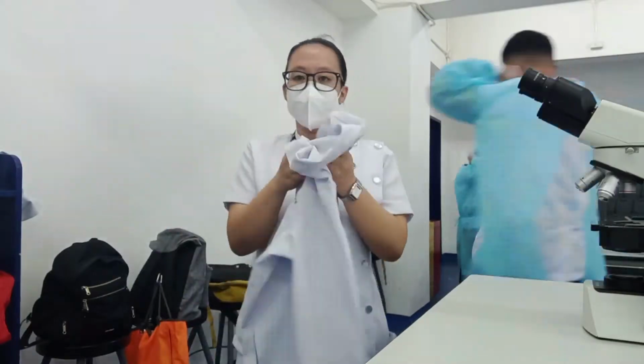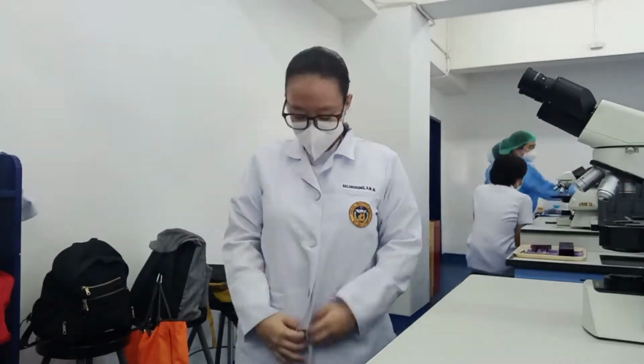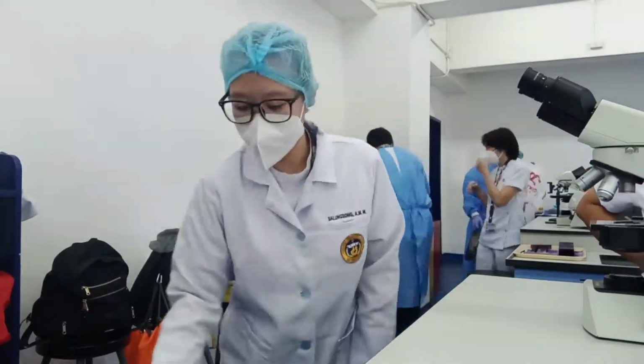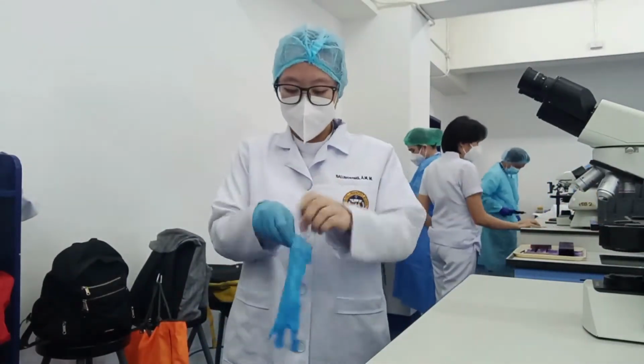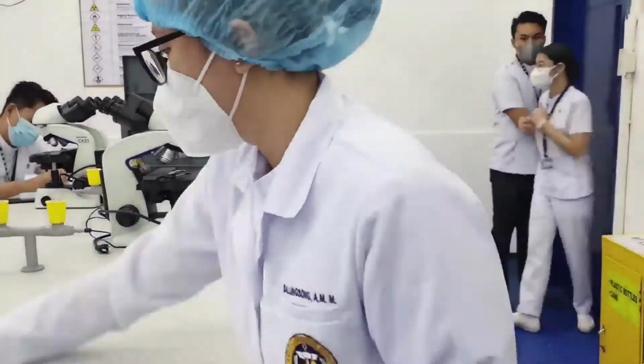Before performing the test, make sure to don the PPE. Wear your laboratory gown, mask, head cap, and gloves. Also, do not forget to disinfect your working area.